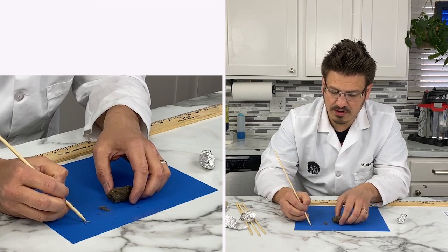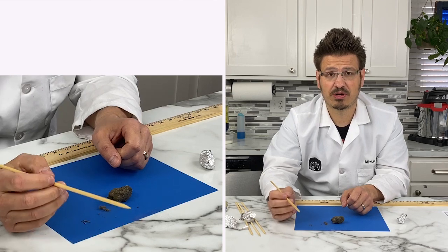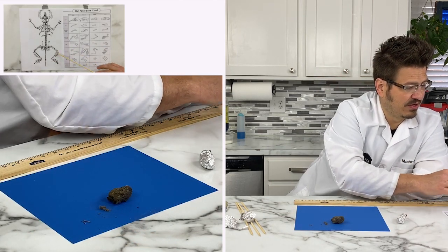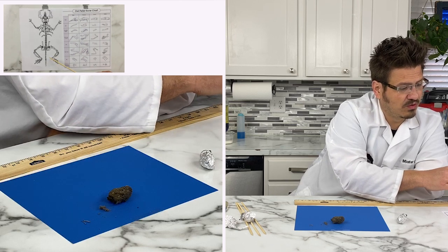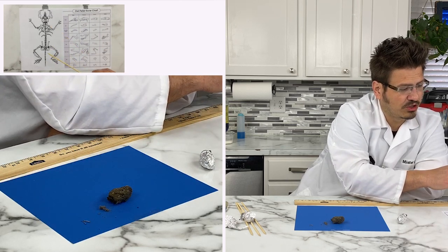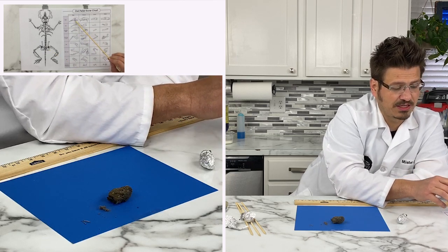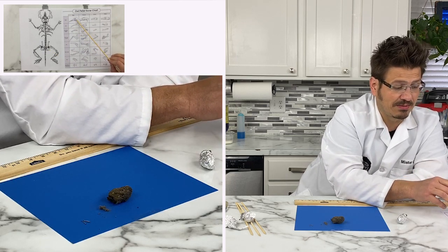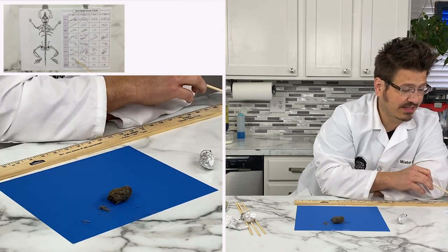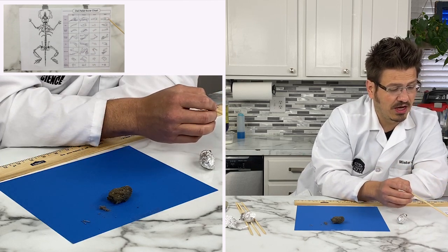Now, before we get too far into this, we have a bone identification chart that we wanna put up on the screen for you. And we have here, it looks like a mouse skeleton or a shrew. But then here we have all of these different things. So we have a possible bird. So owls do sometimes eat smaller birds. So we have possible, we can maybe find a bird skeleton today, a mouse skeleton, a shrew, or a mole.